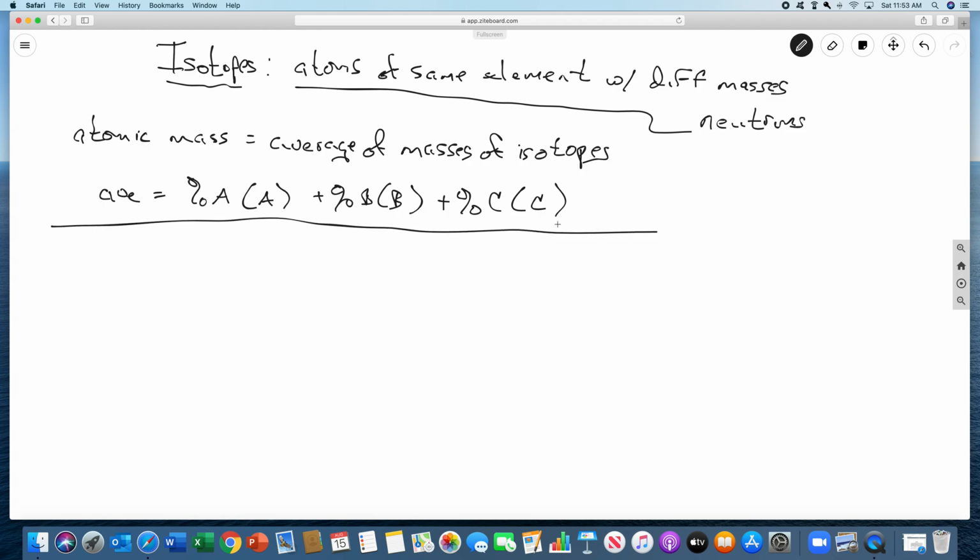So what you're going to do in the first part of the lab, in part A, you're going to basically do an isotope demo. In my lecture, if you saw what I did with the paper clips. All right, so it turns out pennies, we're going to use PE is pennium. And we're going to call pennium 1 the pre-1982 pennies, because pennies changed their composition in 1982. All right, and then pennium 2 is going to be post 1982. And in the video, we did this, and you can get the masses from the video unless we actually give them to you. All right, and so you can get the masses.